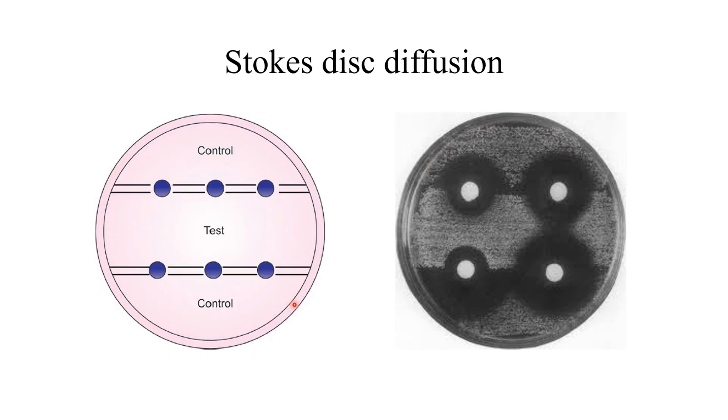Here this is the Muller-Hinton agar plate. This Muller-Hinton agar plate we will divide into three parts. The first part, second part and the third part. This first part we will inoculate or we will lawn culture the control strain and this middle part, the second part we will inoculate the test strain and the last, the third part we will inoculate the control strain. That means the first and third part we have the control strain and the center part we will inoculate the test strain.